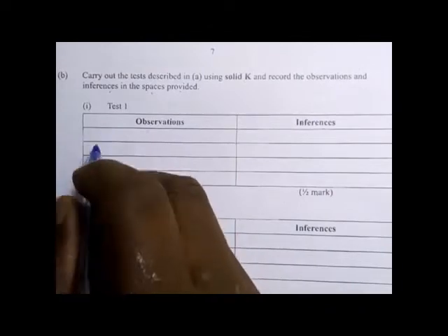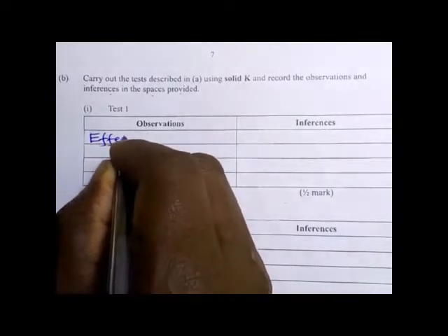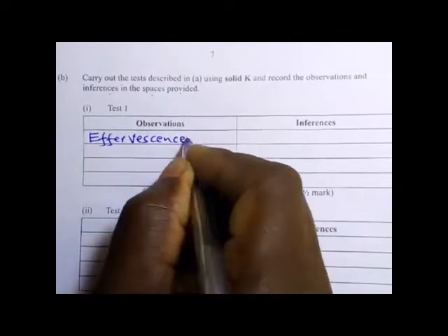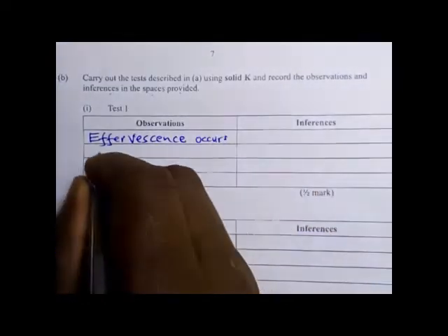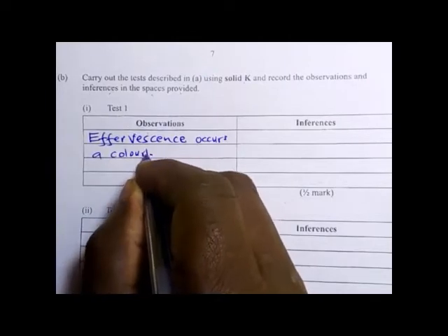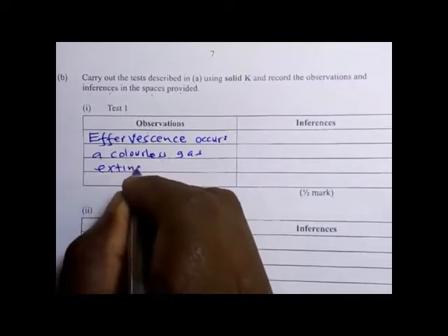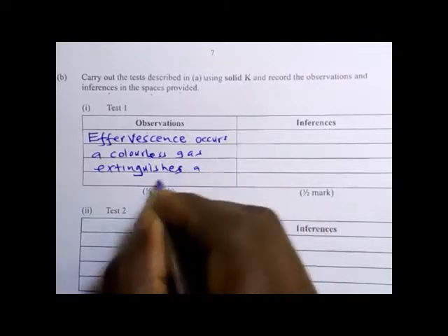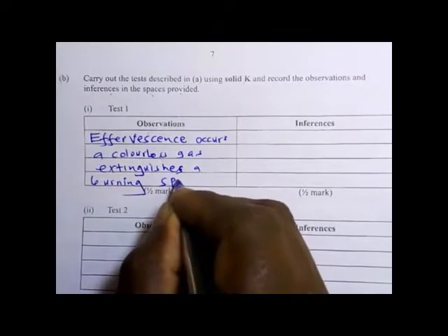The observation was, as we have said, that effervescence occurs, a colorless gas is produced, which extinguishes a burning splint.